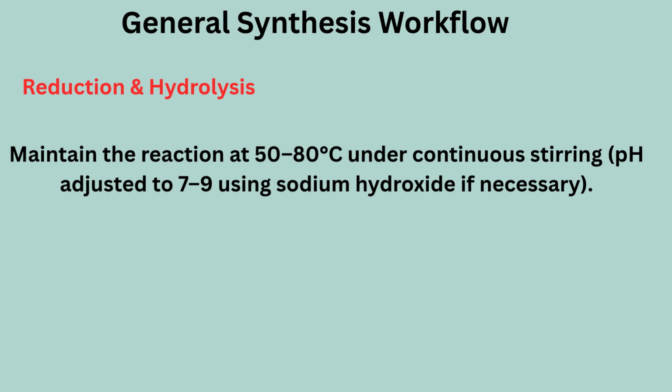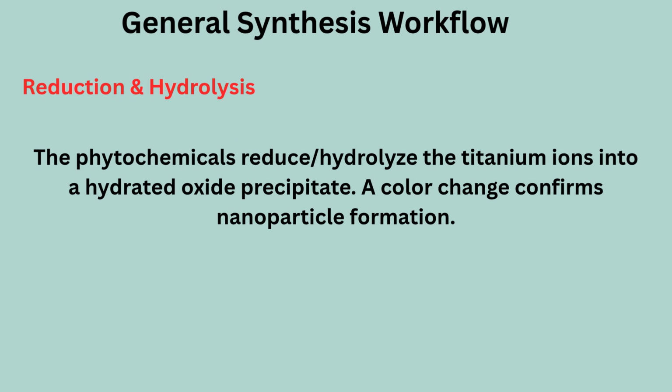Maintain the reaction at 50 to 80 degrees Celsius under continuous stirring, pH adjusted to 7 to 9 using sodium hydroxide if necessary. The phytochemicals reduce and hydrolyze the titanium ions into a hydrated oxide precipitate. A color change confirms nanoparticle formation.